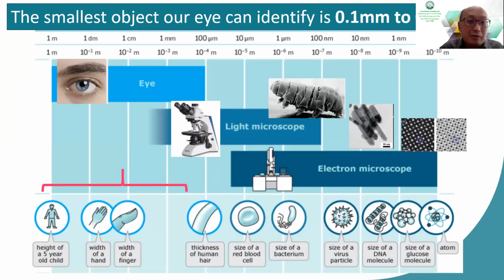The electron microscope is very powerful. It has a high resolution that can see structures of crystals, and it can go to imaging the lattice structures of this material.